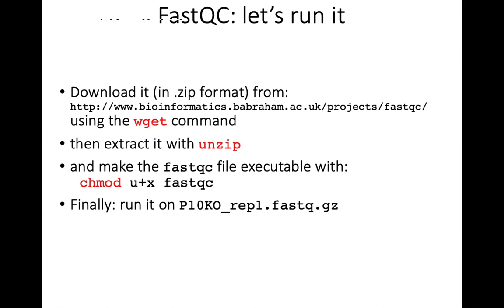It should have worked. Not yet. The terminal is kind of a hotspot. Now it's green, and that's because you can run it directly. So if you try to just run it, just type FastQC. Oh, it actually is going to be ./FastQC. So just type ./ with no space, and then FA, then tab. Yeah, like this.